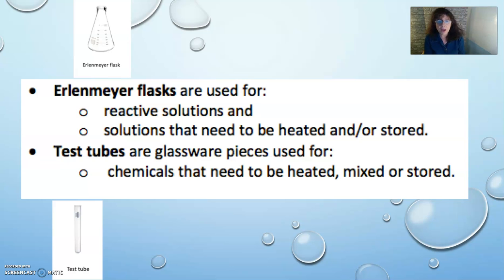Test tubes are glassware pieces that are generally used for lower volumes than an Erlenmeyer, and they're used for chemicals that also need to be heated and mixed and react and store, but lower volumes.